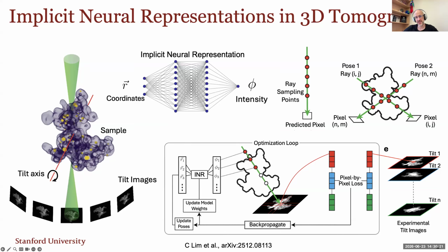And speaking of it being continuous, this is beautiful when you want to do things like regularization, because normally, let's say you do total variational regularization, you have to look at the difference of pixels against their neighbors, or voxels against their neighbors. However, here we can do exact regularization because we can differentiate the network on a continuous field. So we can always evaluate any operator with arbitrarily high precision on the network.